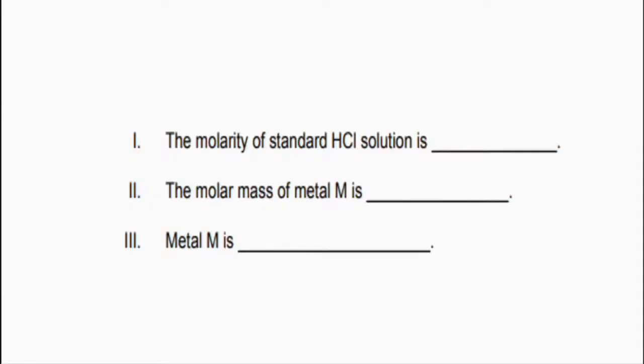Conclusions. Finally, for the conclusions, what can we say? First, the molarity of the standard hydrochloric acid solution used in this experiment is 0.8088 molar.